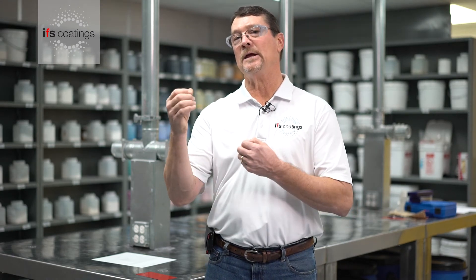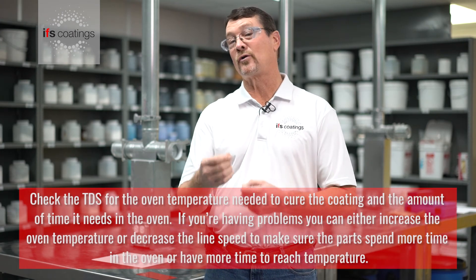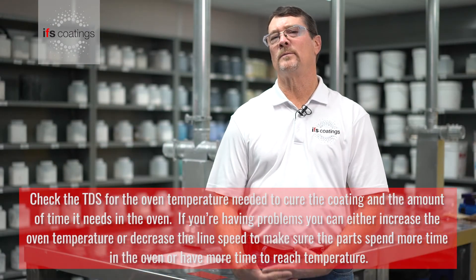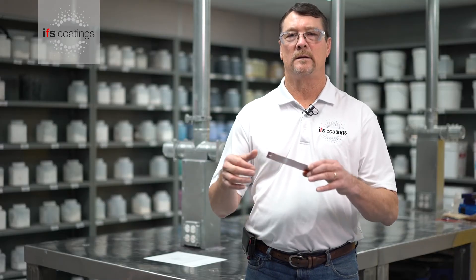So if you do have a problem with this, you can always put it back into the oven and then either slow the line speed down, increase the oven temperature, or maybe a combination of both. Another thing I wanted to point out is the thickness of the substrate being used.